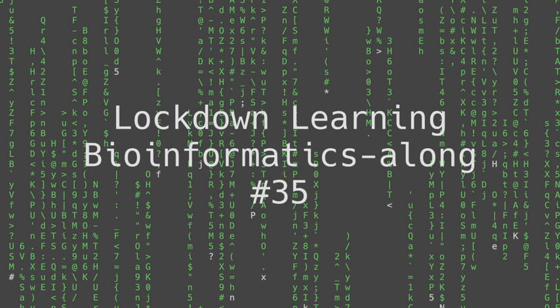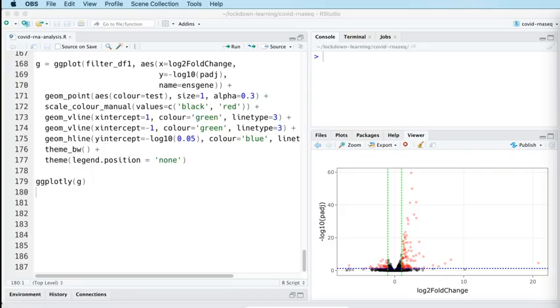And so to today, to day 35. Where we're at is we spent yesterday producing these reasonably standard plots for RNA-Seq data.